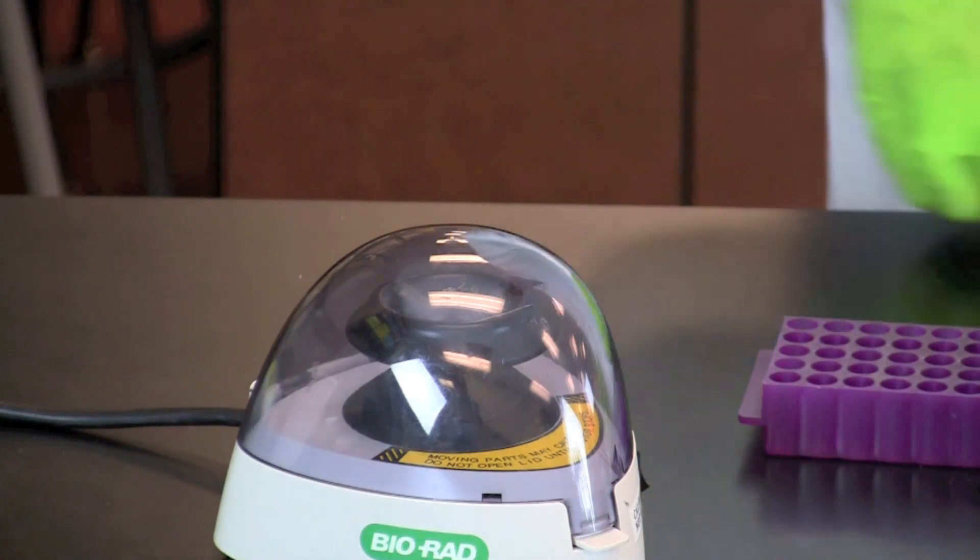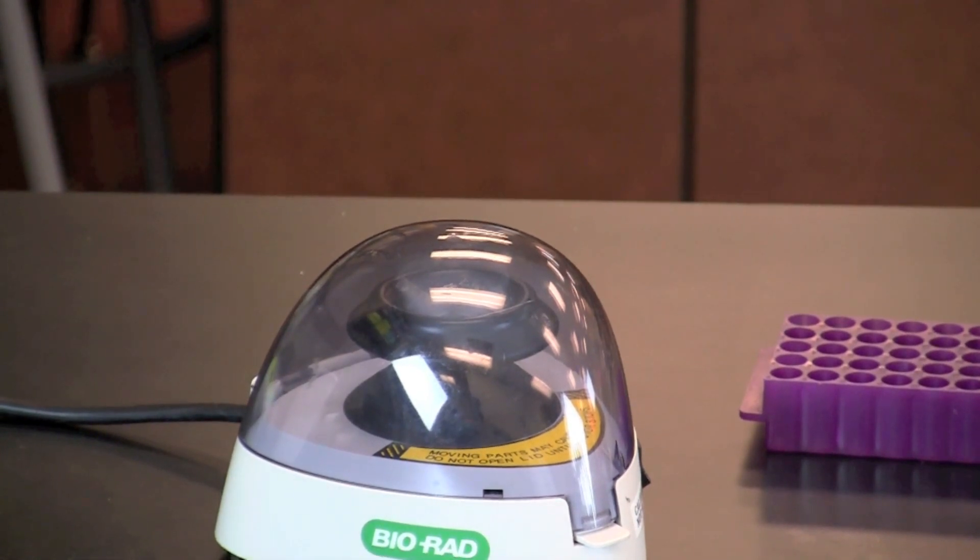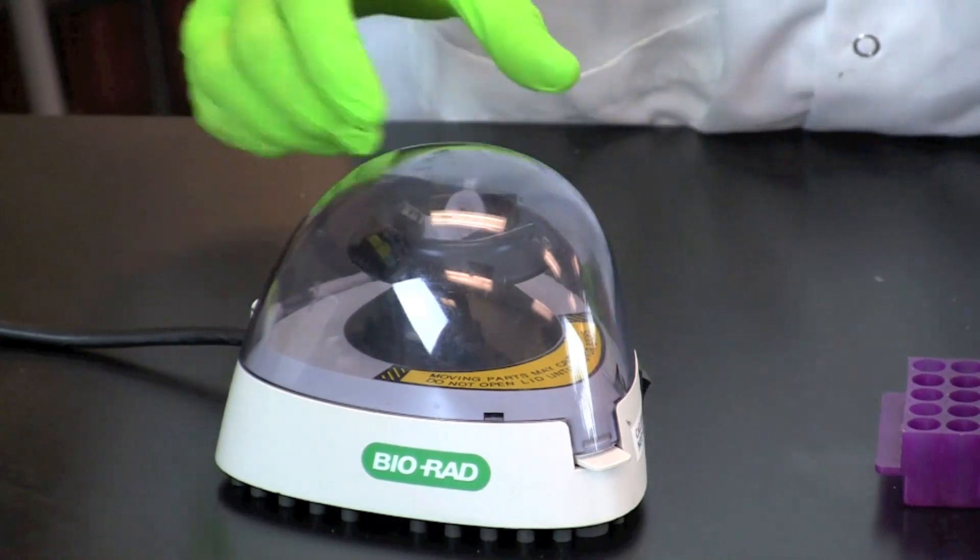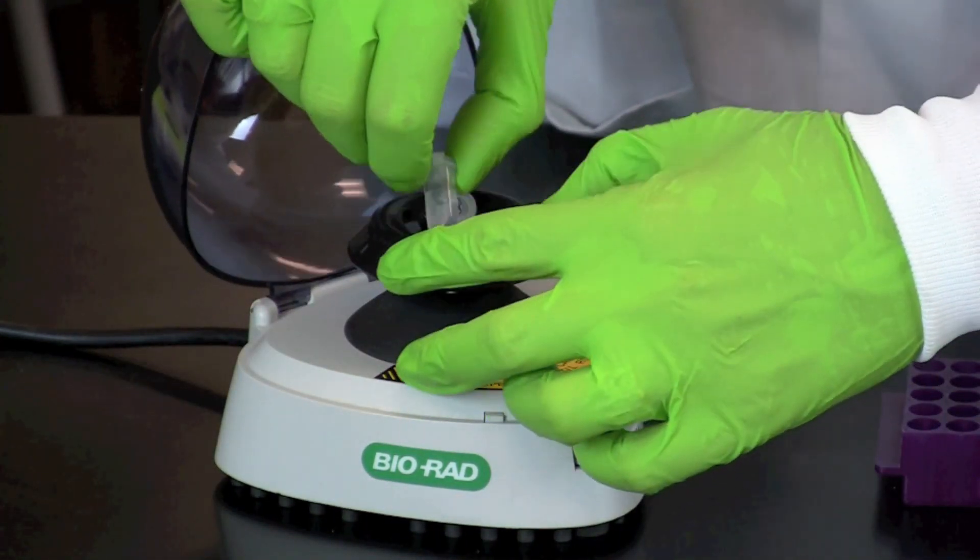Centrifuge at maximum speed for 2 minutes. If you are using a mini-centrifuge that can only reach 2,000 G's, centrifuge for 5 minutes. Locate the cell pellet. The pellet should be white and be the size of a match head.